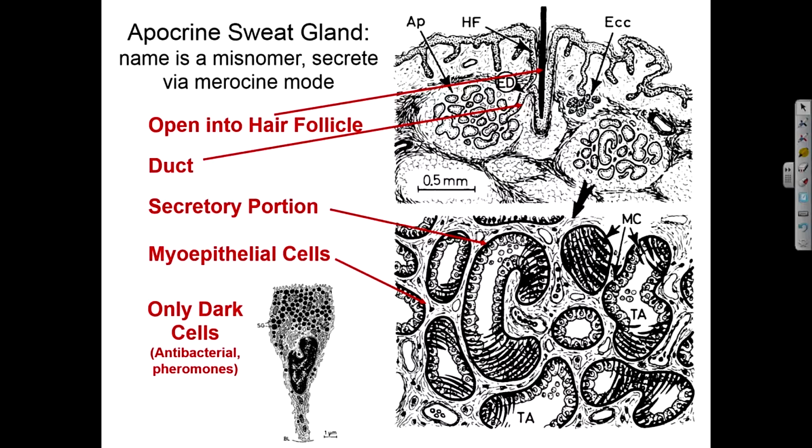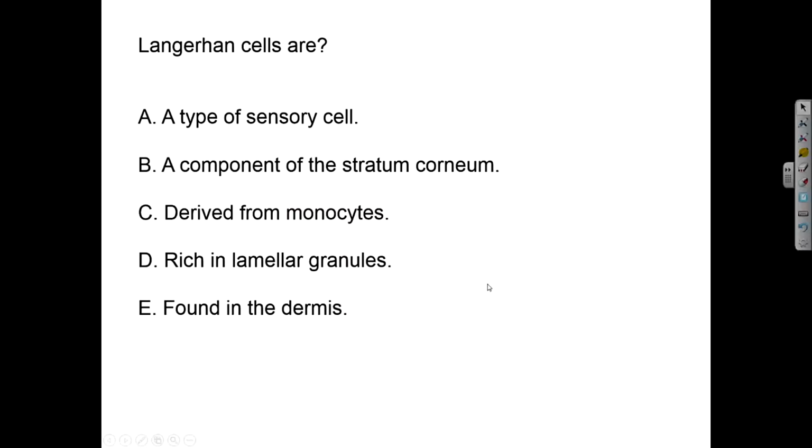These cells could be more active. And they open onto the hair shafts in the axillary regions. These also have a much larger luminal diameter, so in comparison to an adjacent merocrine sweat gland, you can identify the different types of glands.